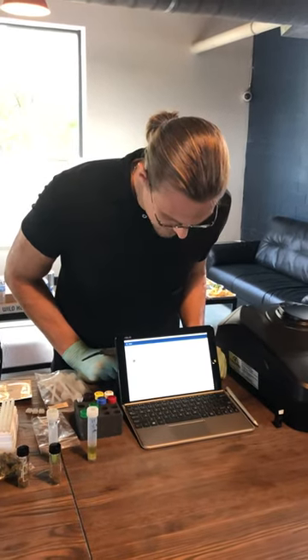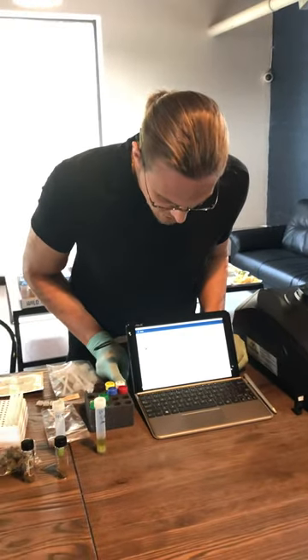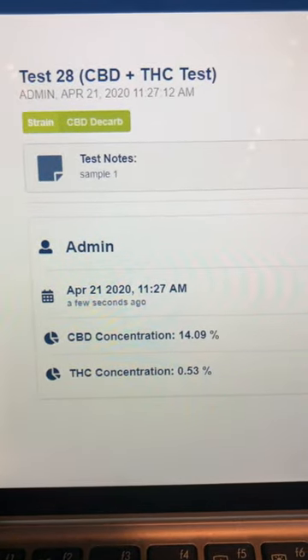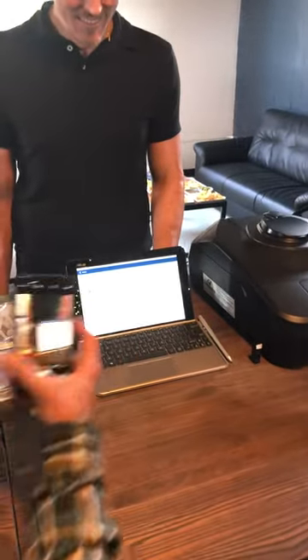Quick save results right here, and here we go. Here are our results: 14.9% CBD and 0.53% THC. So that's probably why he was selling it — that may be why he was selling it out the back and not out the front. We want to make sure we started testing early on to make sure you didn't get it that high.